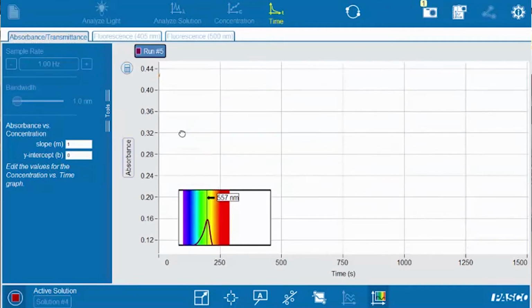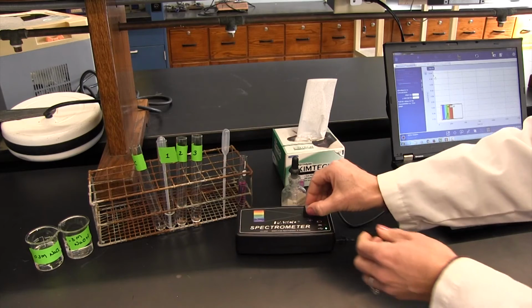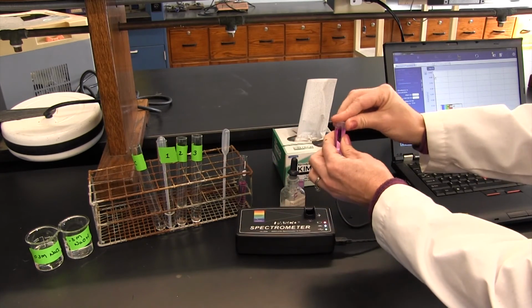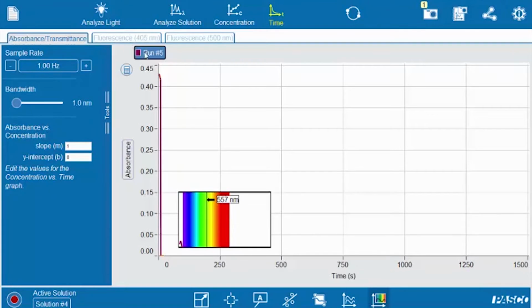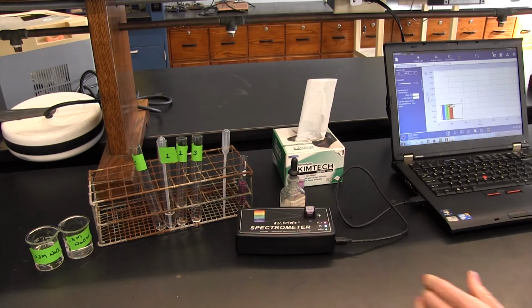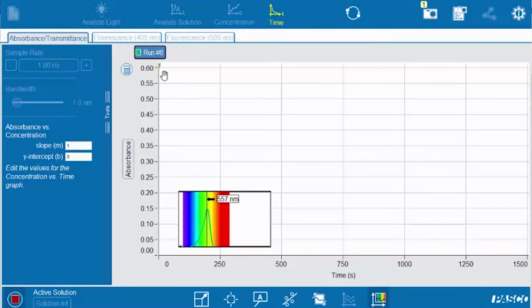And what we want to see is if our initial absorbance is above 0.5. And you can see we are not. We're actually at 0.43. So we're just going to take this out. We're going to add just a tad more phenolphthalein. Put it back in. I'm actually going to press stop here to delete this run. Put our new solution back in, press record, and this time we should be above 0.5. Yes, so we're at an absorbance of 0.6.